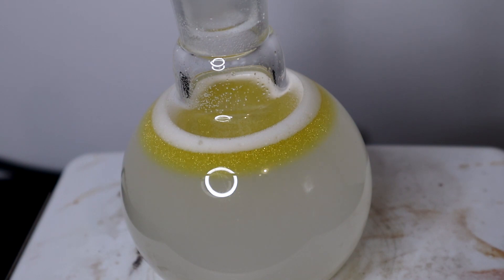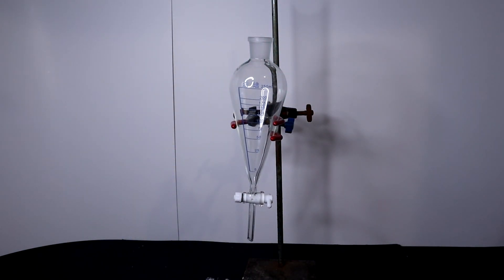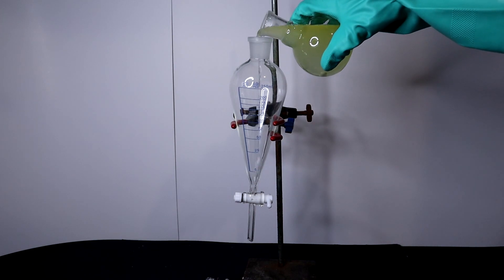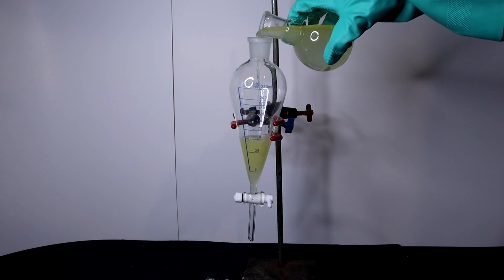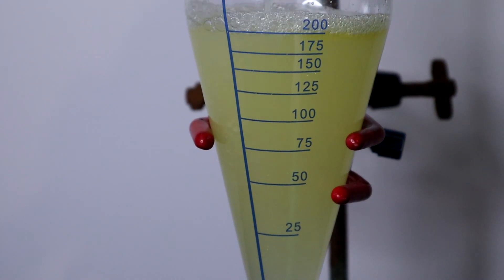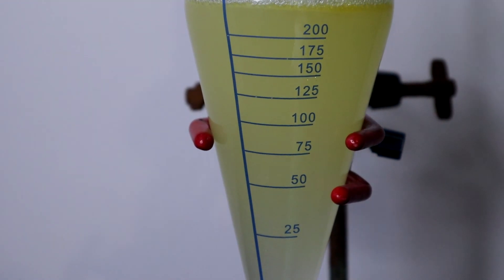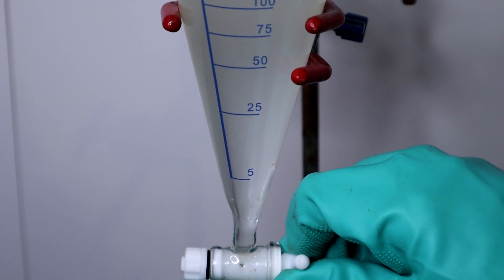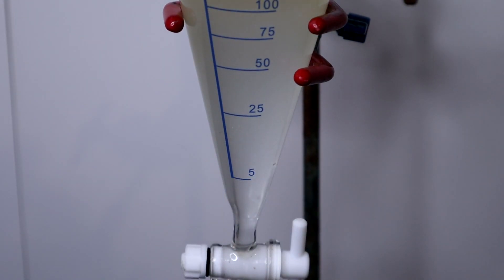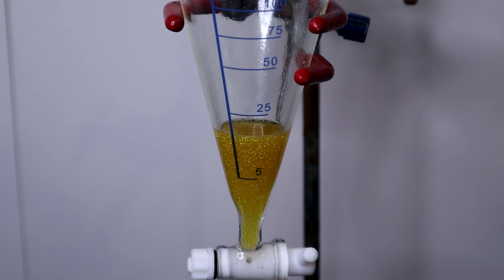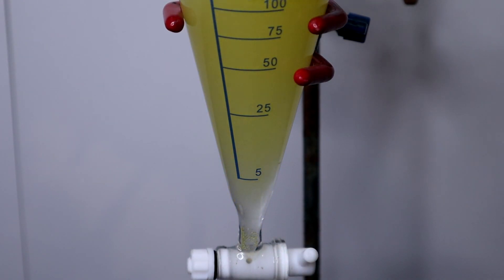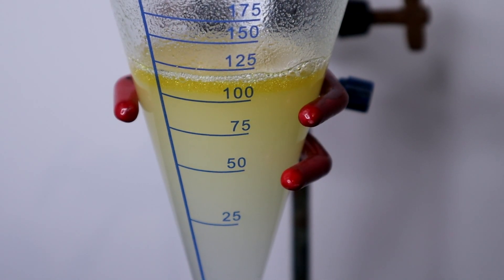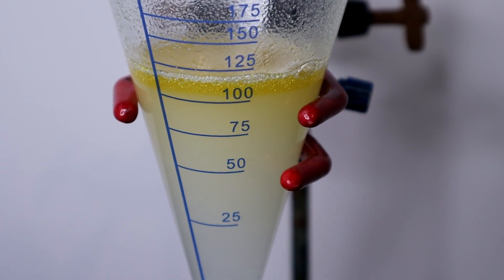This solution was then poured into a 250ml separatory funnel and the lower layer was removed. The leftover yellow liquid was then washed once with 100ml of a saturated salt solution, then followed by 100ml of distilled water.